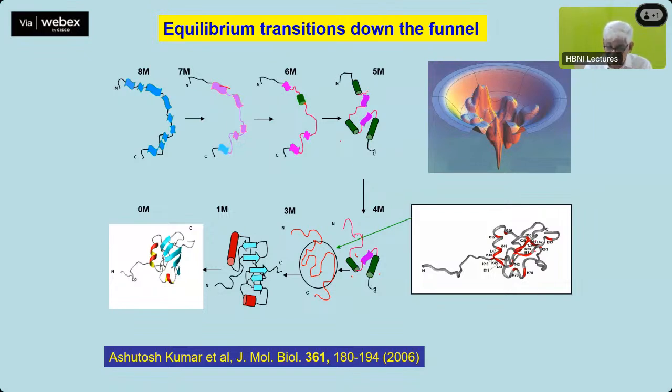Okay, and that means this is the folded protein structure. In other words, this protein is now all set to fold into this state. What does that mean here? Then why are these ones disappearing? This is the implication, that the folding does not necessarily follow the native structures, does not monotonously change the structure to reach the folded state.